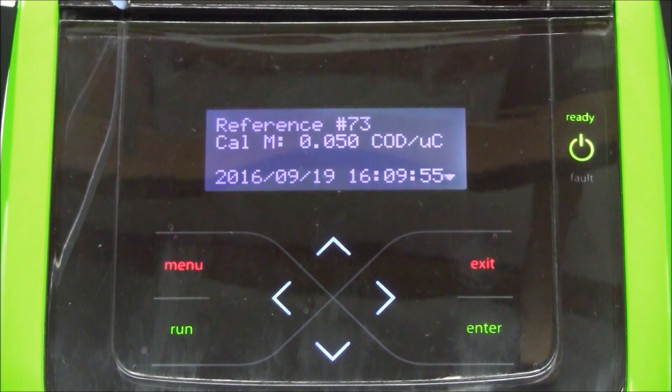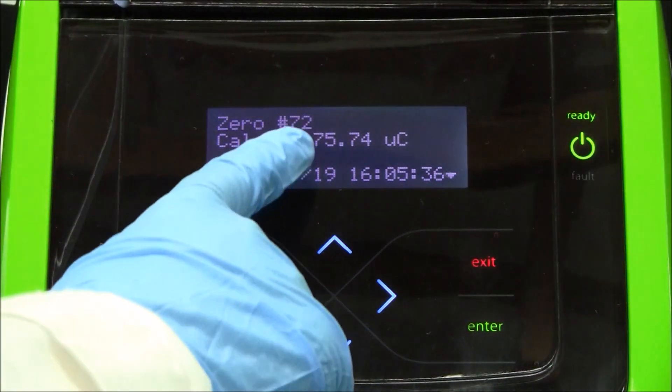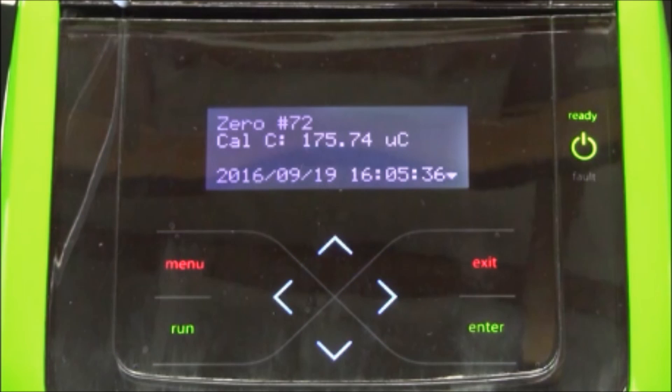When calibration is complete, the M and C values are displayed. If they are within specified limits, the sensor is conditioned and the L100 is ready for analysis.